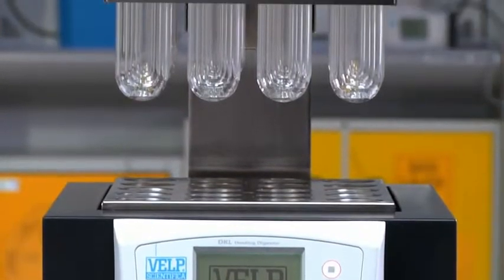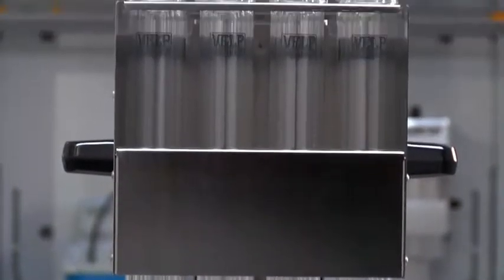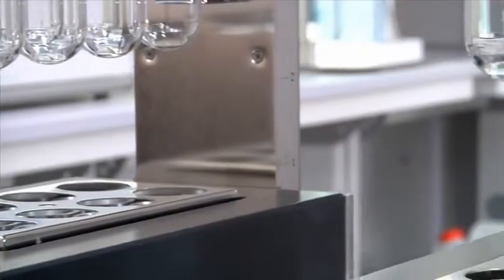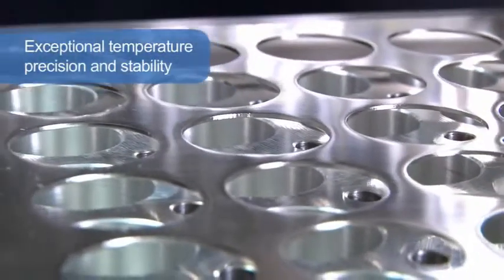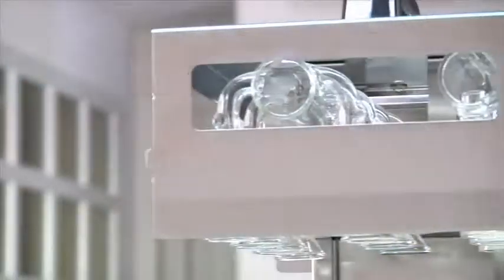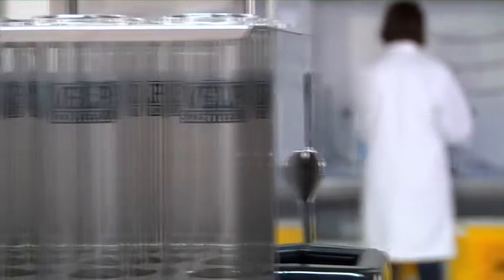The DKL Series – Fully Automatic Kjeldahl Digestion Units. The new automatic Kjeldahl digesters from VELP Scientifica provide users with the ultimate technology, whose objective is to simplify operation and improve safety. The DKL Series offers exceptional temperature precision and stability, only plus or minus 0.5°C for all samples, allowing complete and homogeneous digestion and covering a temperature range from ambient to 450°C.